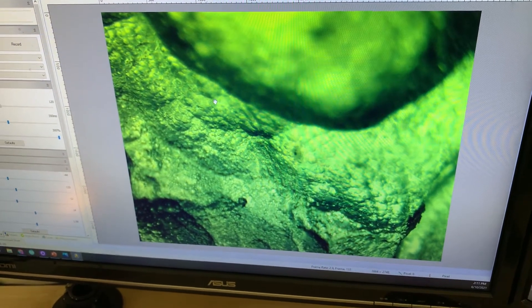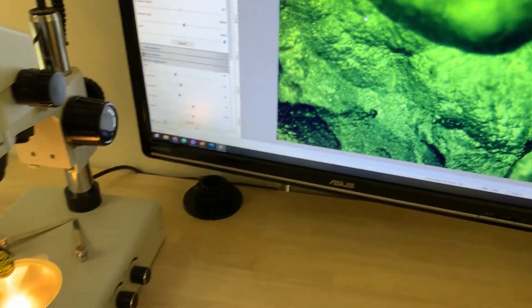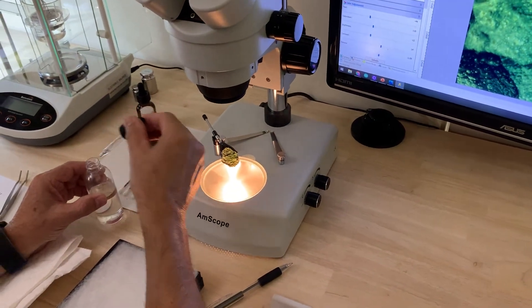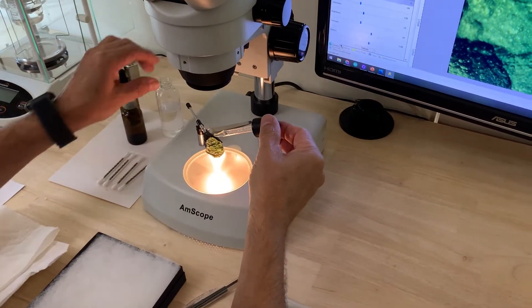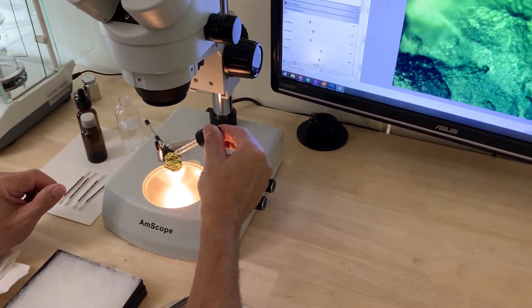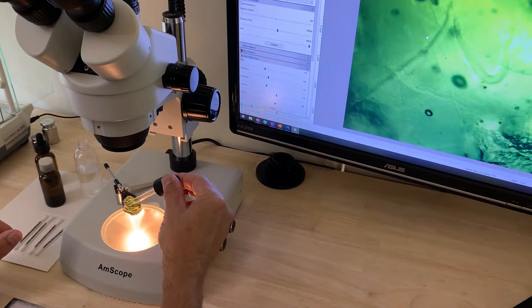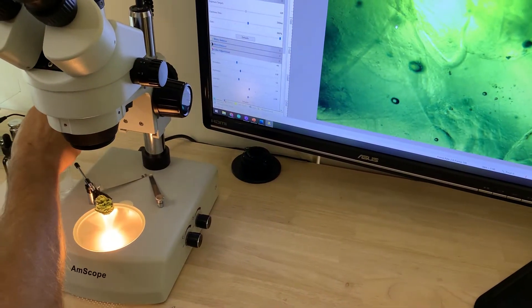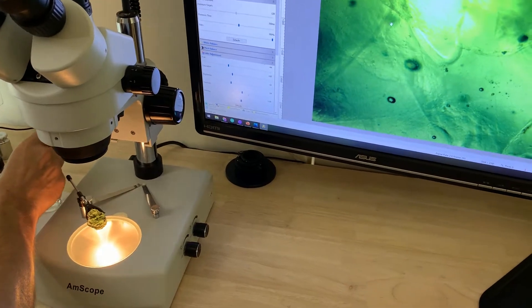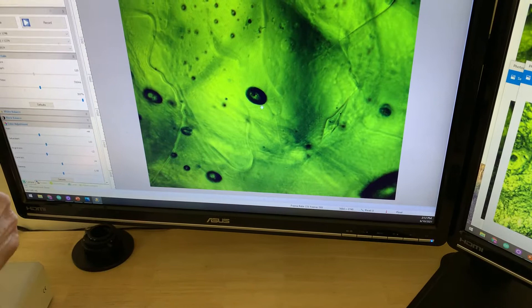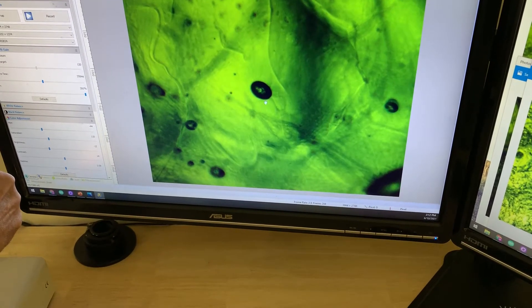We take a refractive index fluid that has a refractive index very similar to moldavite, which is about 1.5 to 1.55, right in that range. We put it on there, and that refractive index allows us to wash the texture out a little so I can get a crisper view of what's actually inside the moldavite. I'm actually focusing in through the moldavite.